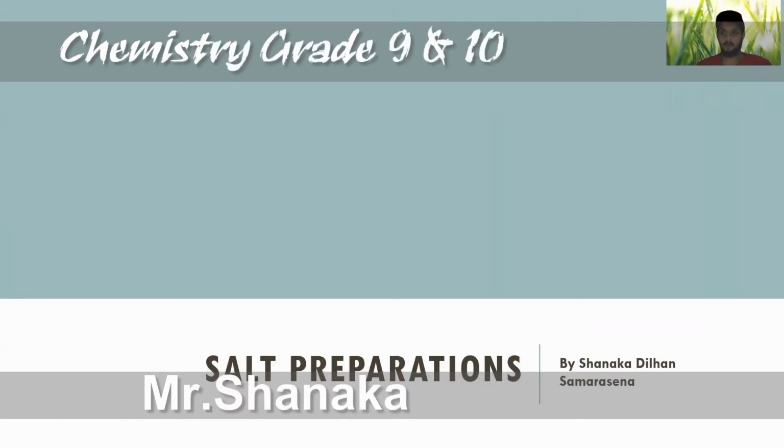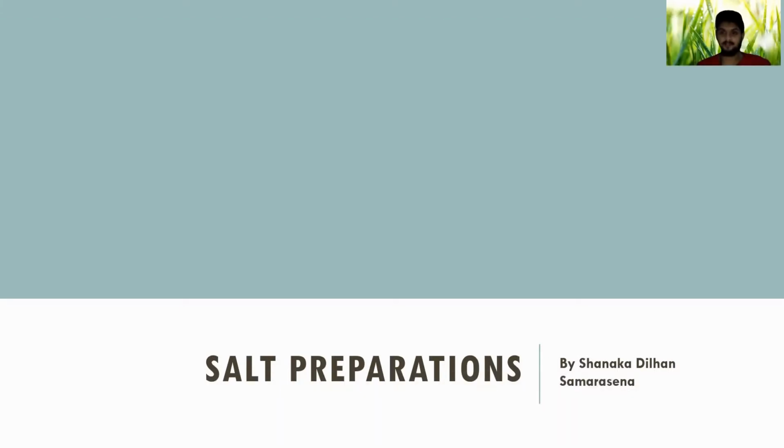In this video, we'll be looking at preparation of salts. We'll be discussing the things that we are able to do in the lab. All the procedures that we are doing to prepare these salts, we would write down theoretically, and you need to learn that. All right, so let's move on.